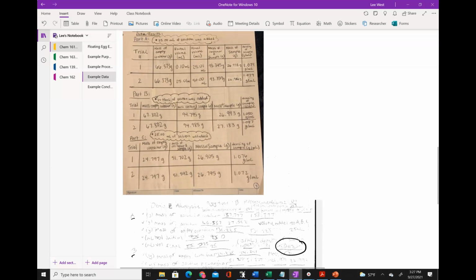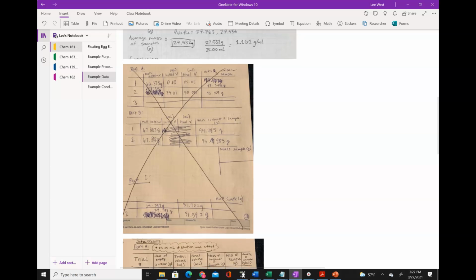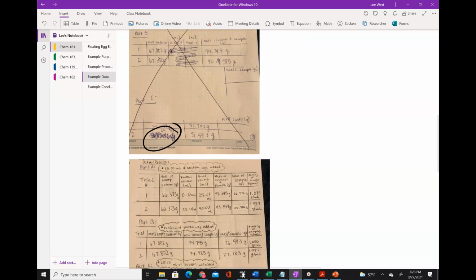Okay. Now, here's what you don't want to be doing. This person came in and they weren't that well prepared, and they realized that the tables they'd made were not actually what they wanted. And so they ended up just giving up, right? And they had to scratch everything out. The big cross through is good, but this kind of obliterating stuff is not really cool. We don't want that going on.